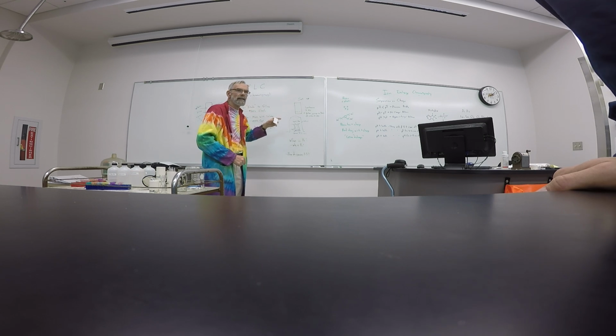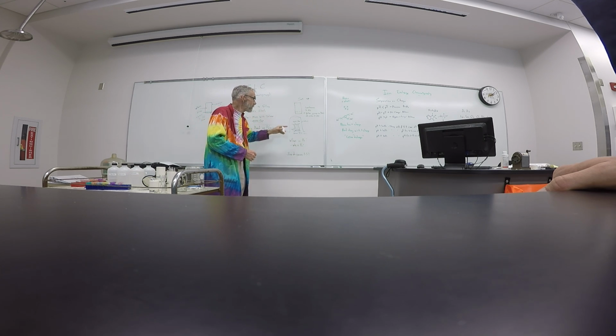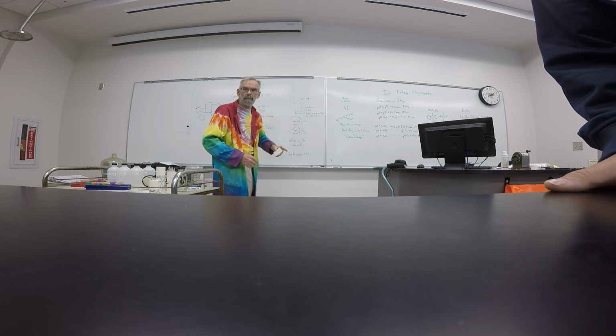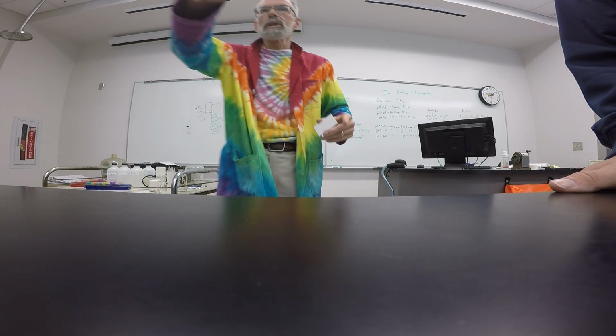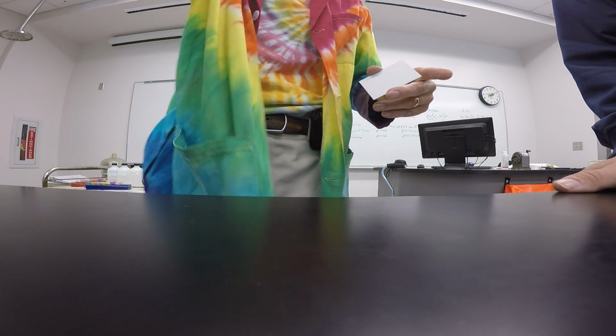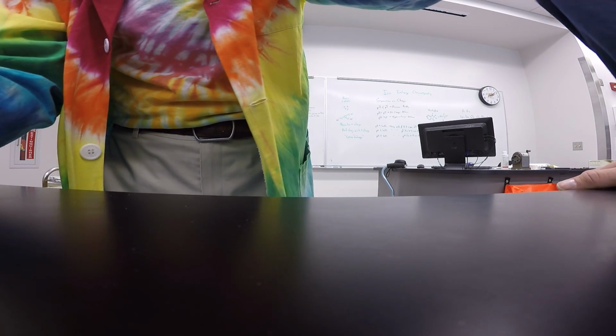Now, there are fancy little chromatography setups. We don't have any of that. So what we're going to do is a quick fudge, and that's what this is trying to show you. The quick fudge is I put out a 100 ml beaker and a watch glass. So this piece should just fit in.